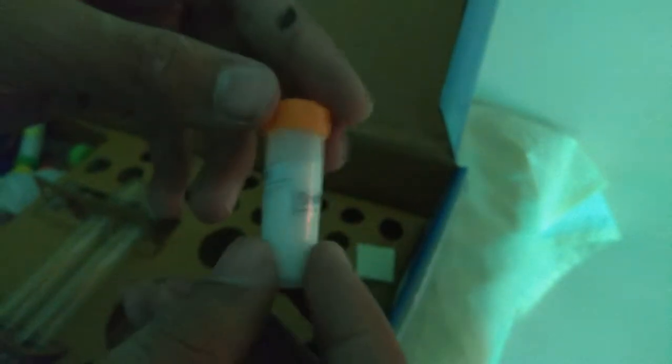Sodium carbonate and two more test tubes. So that's all here for this chemistry kit.